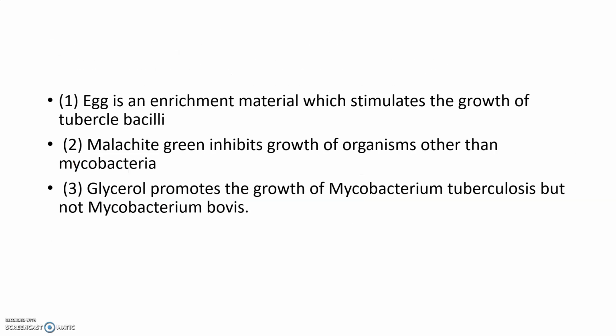Egg is an enrichment material and it can stimulate the growth of tubercle bacilli. Malachite green inhibits the growth of organisms other than Mycobacterium. Glycerol in the media promotes the growth of Mycobacterium tuberculosis but not Mycobacterium bovis.